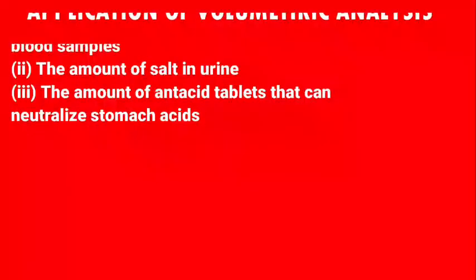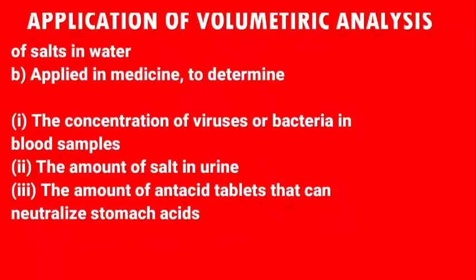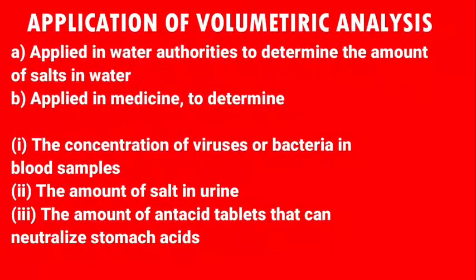Let's see the application of this practical. This practical deals with volumetric analysis. That means it is based on determination of the volume and the concentration of the solution. Due to that, this practical is applied in the following fields or different areas of daily life.